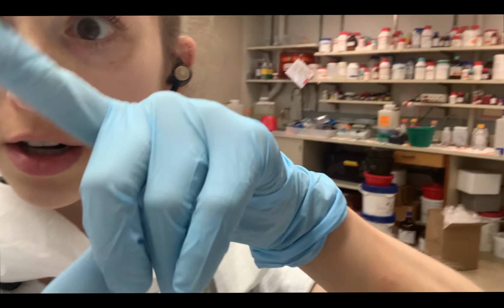After I do the washes in the phosphoric acid, I do a wash in acetone. Acetone is like nail polish remover, where your fingers get all dry. So the acetone helps dry the paper. We air dry it, then stick it in the scintillation vials, and then stick it in the counter, and it goes.